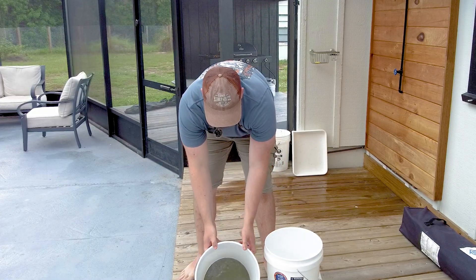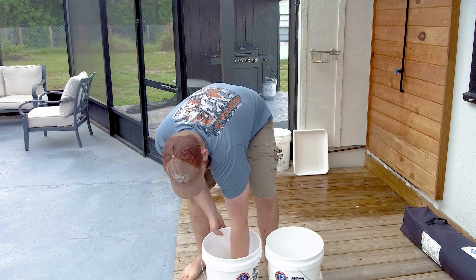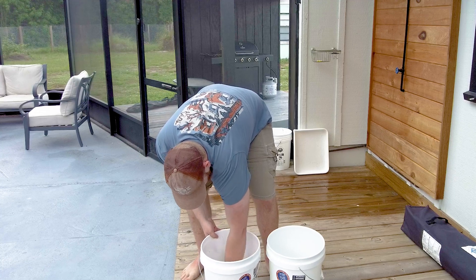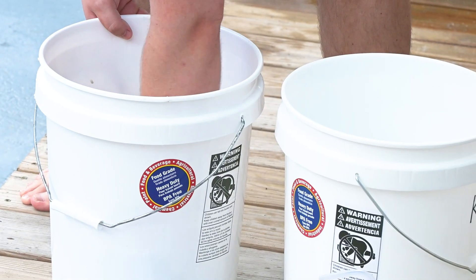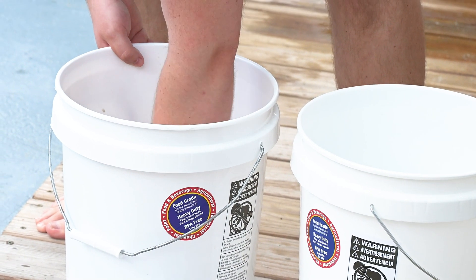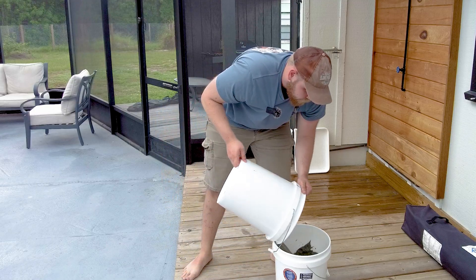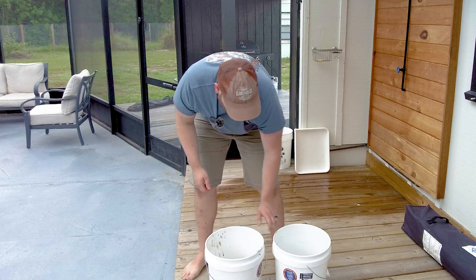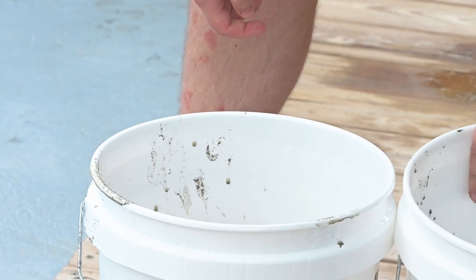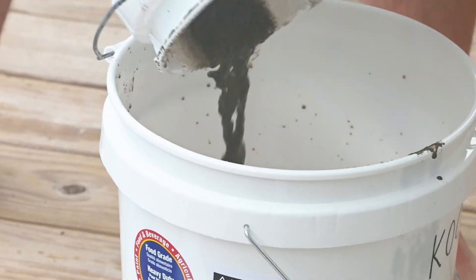We've got some sediment and some seawater. You want to make sure you stir it up really good — suspend all of that sediment. Then very quickly pour it into your second empty bucket. You're going to pour it back and forth about five to ten times. This is a very messy process, so be somewhere you can clean up or you don't care if it gets dirty.